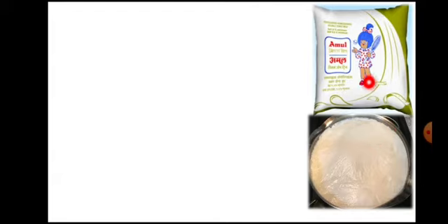That means this is properly pasteurized, so phosphatase enzyme is destroyed. This is boiled, obviously phosphatase enzyme is destroyed. So both are going to be used to prepare a control.